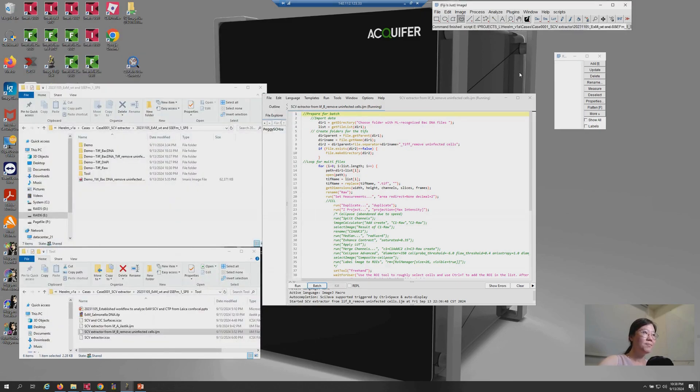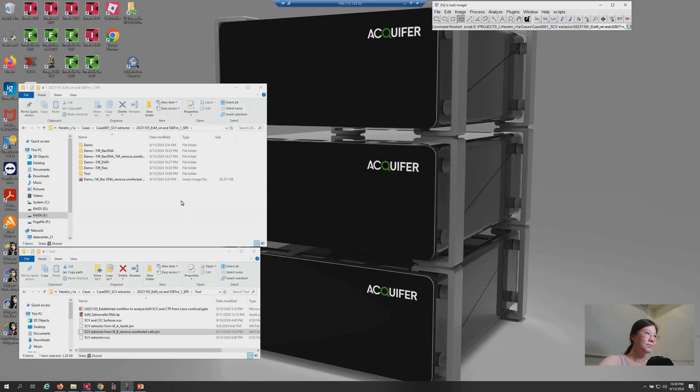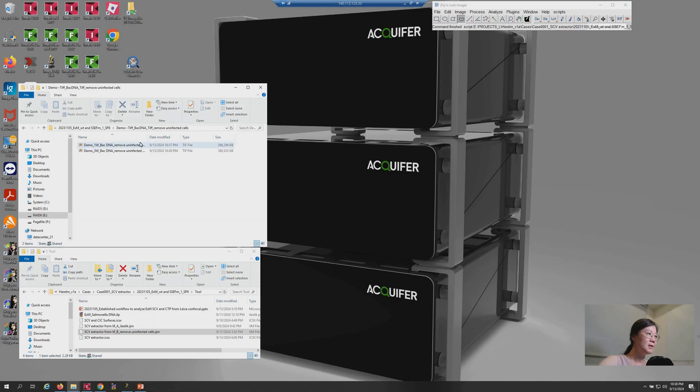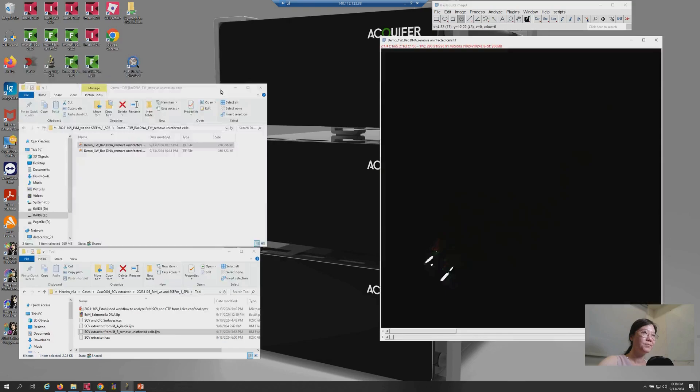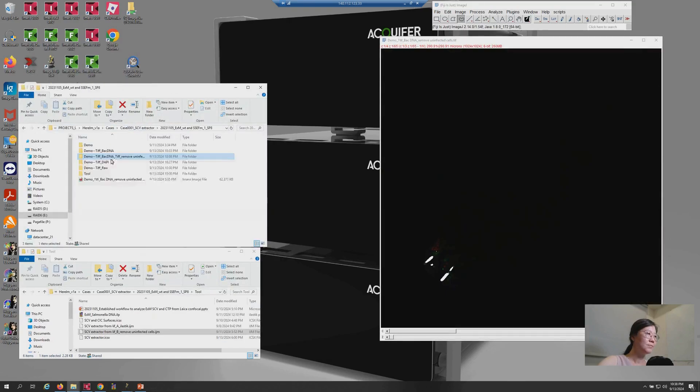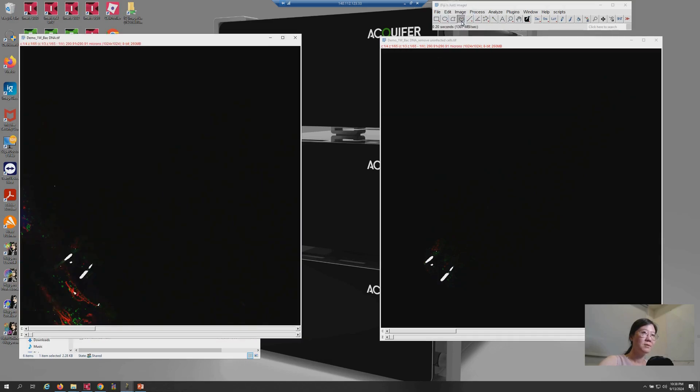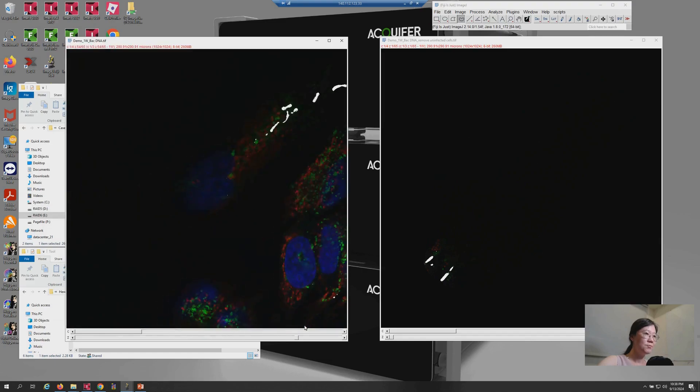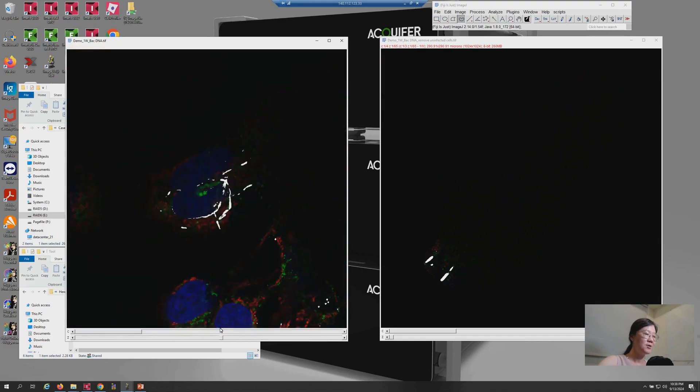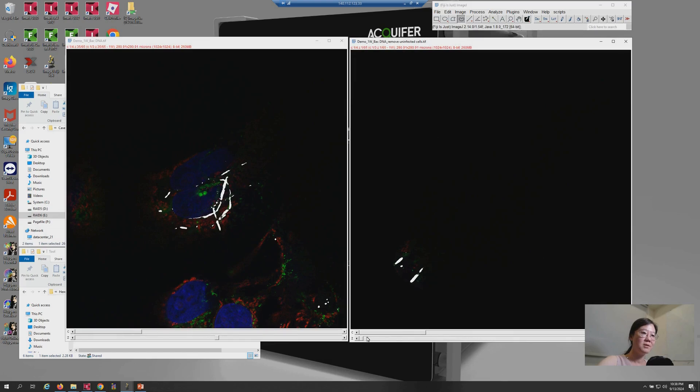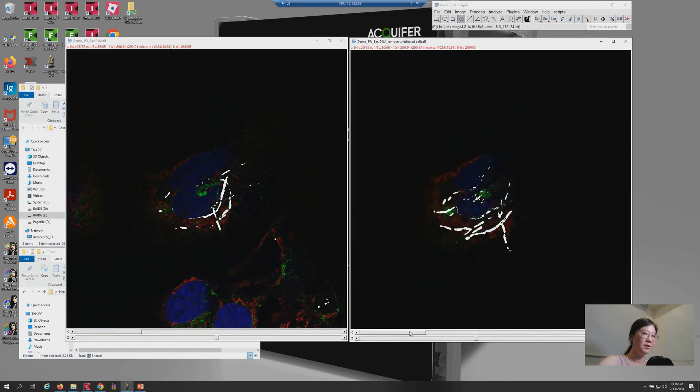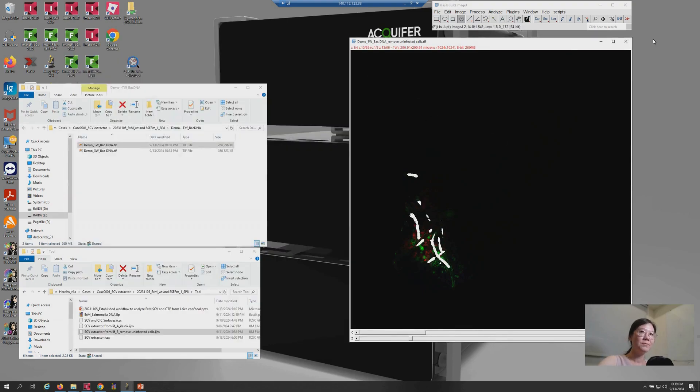So, now the image is ready for further quantification or to generate the model. So, let's close this one. So, now you can view the images here. For example, this one. After our first process, you will see that there are several cells without infection. But after this process, those cells are removed from the image. So, now this image is ready for 3D modeling.